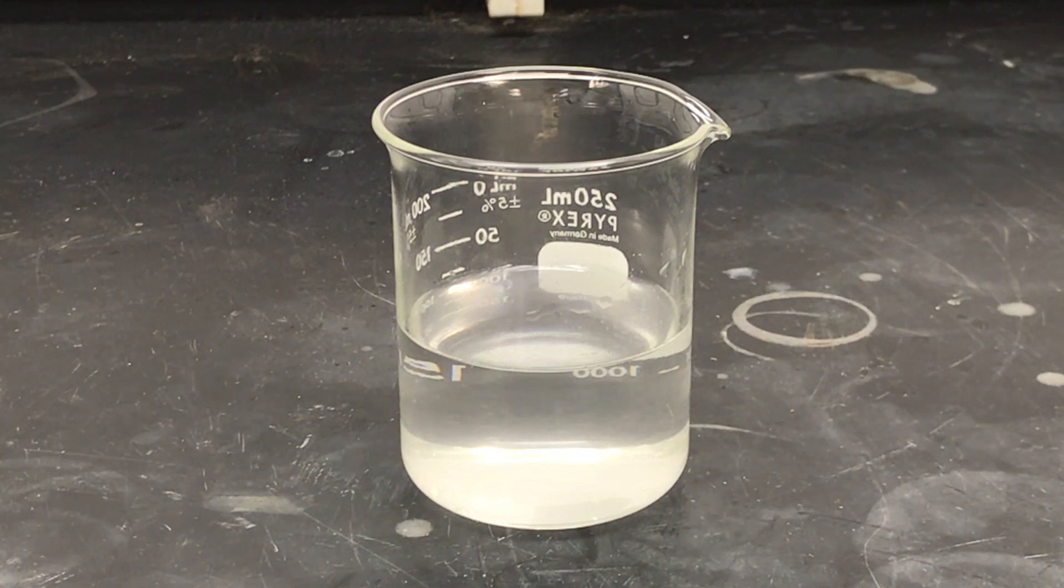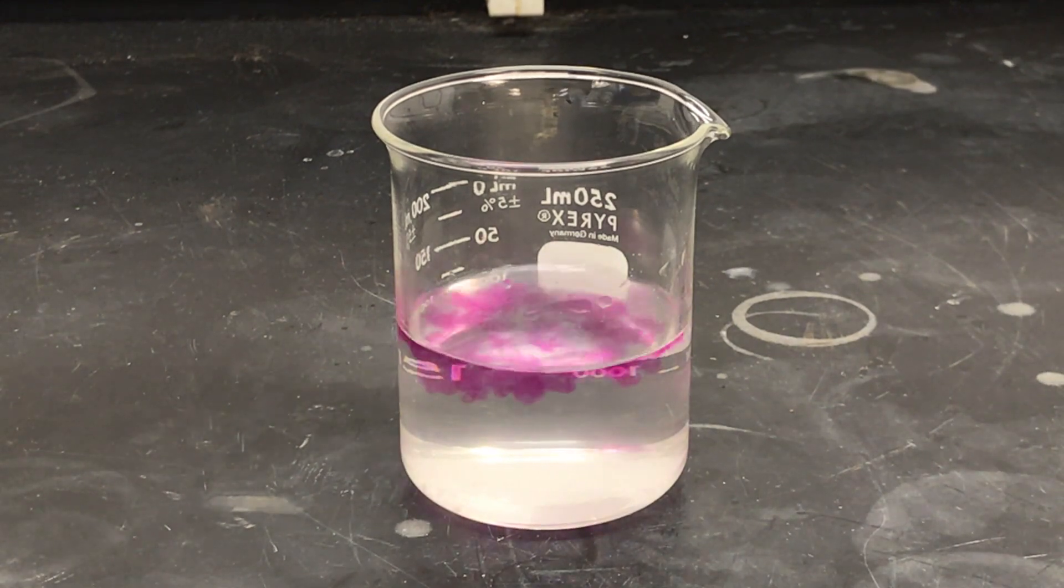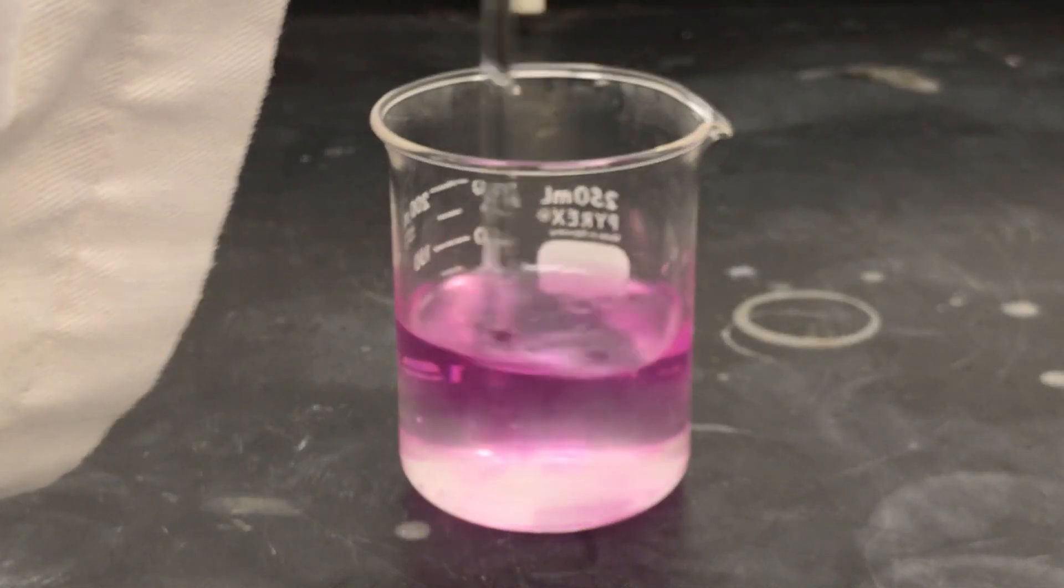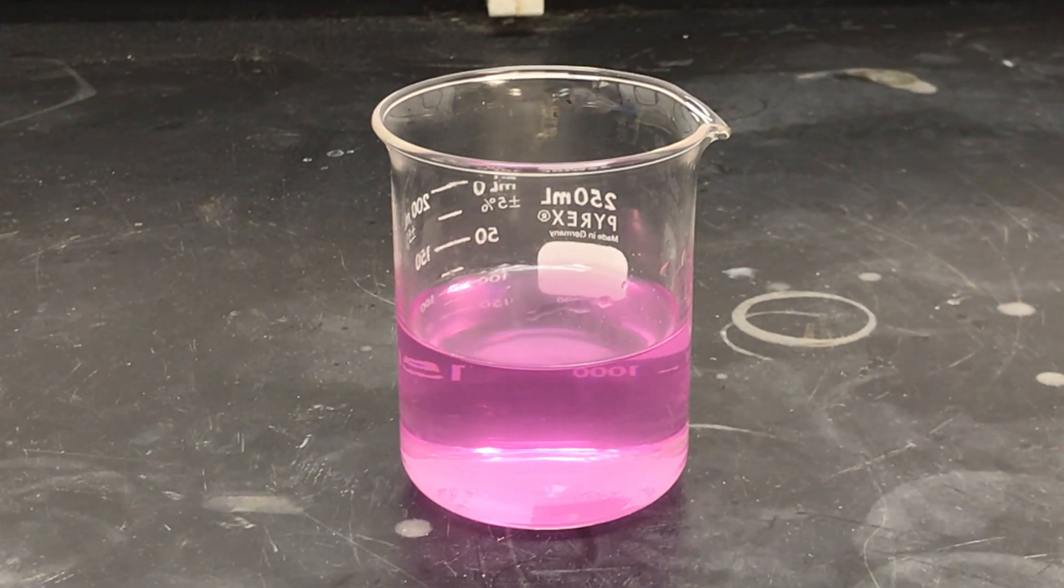We will add two or three drops of the phenolphthalein solution to our beaker with the sodium solution. Upon stirring, we see that the liquid does indeed turn pink. This confirms that the resulting sodium solution is basic and that there are hydroxide ions.